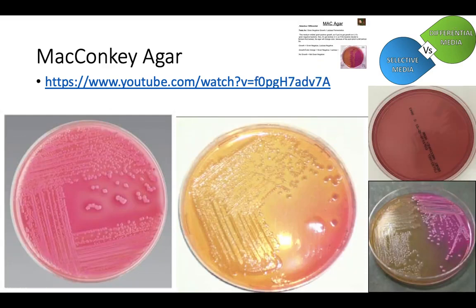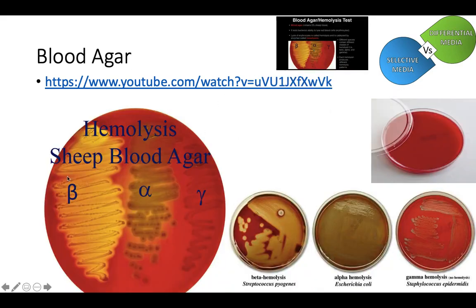Okay, so this is also a gram-positive agar. It's used mostly for gram-positives and specifically for streps. But it is something that most hospitals will just start bacteria on just because it's so easy to grow things on. Because it is for fastidious organisms. So if you have a strep, it's just easy to throw them on here and start going. Or something that you might think is fastidious, it's just easy to throw it on a blood agar plate and skip the extra growing if it doesn't grow on a nutrient agar plate kind of thing.